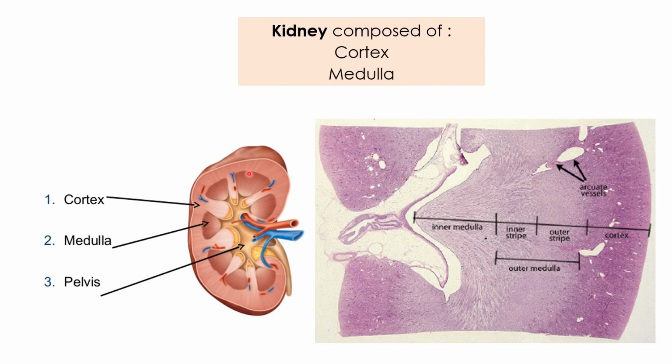Now the second slide. Anyone can guess what this is? This slide is from the tissue of the kidney. This is only the cortex, the cortex part of the kidney. I will explain a little bit what we mean by cortex. So this is a kidney.